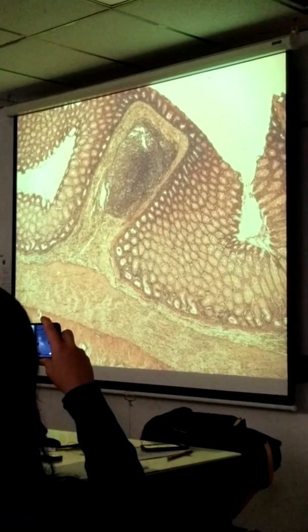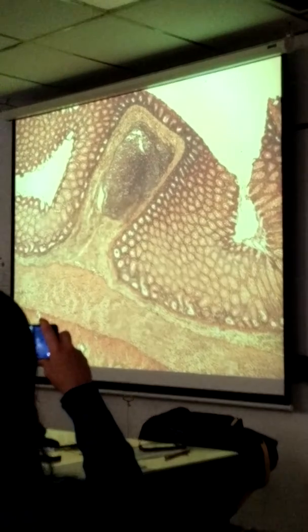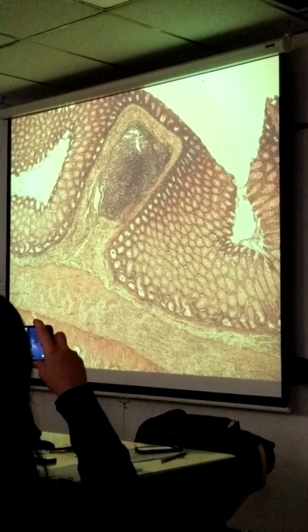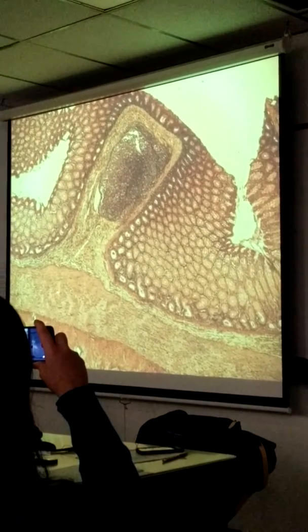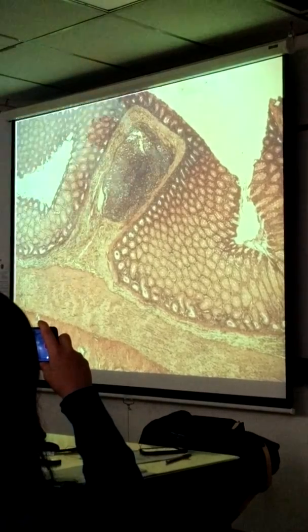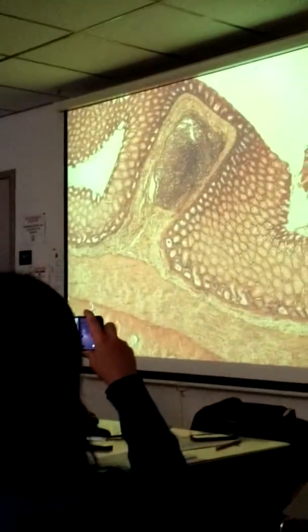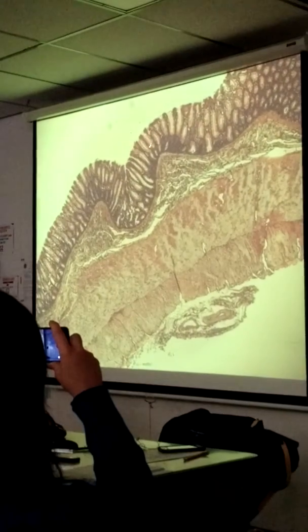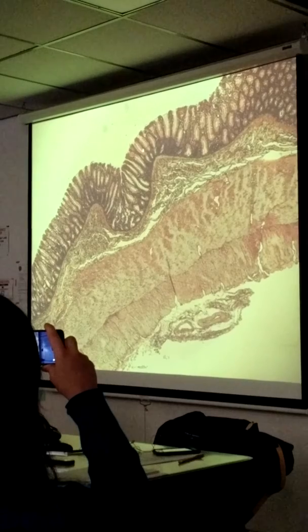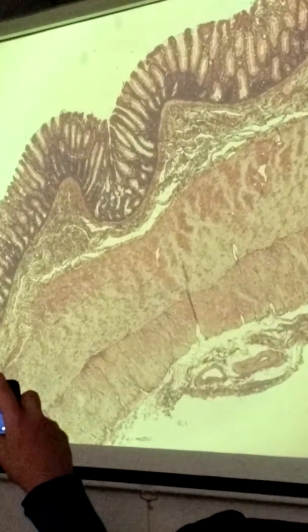That's all mucosa, these tightly packed tubular structures to compact feces. There's a submucosa there, a very pronounced muscularis externa, because you're trying to compact the feces to move it along. So you need a big muscle layer there. What layer is that specifically? Circular, longitudinal. Now, I want to take a close-up picture of these here. There's a lot of goblet cells in the mucosa of the colon.